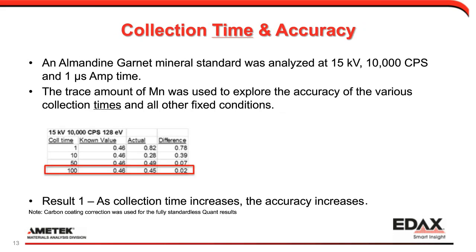So the first part of the study is to change the collection time. And so the question that we often receive is, how long should I collect my data for? And this is a very common question, and it is so easy to answer with an answer that starts with, it depends. And certainly it does depend on a number of things, and that is the conditions that you're working at, namely your beam current or your counts per second, and also your process time.